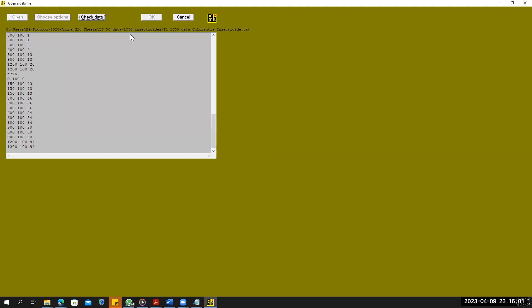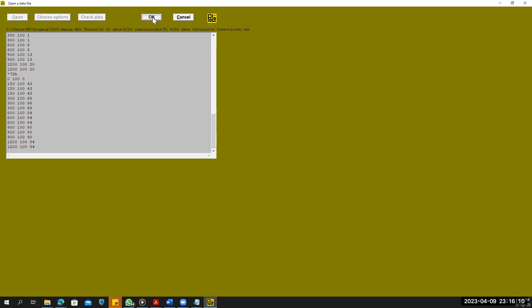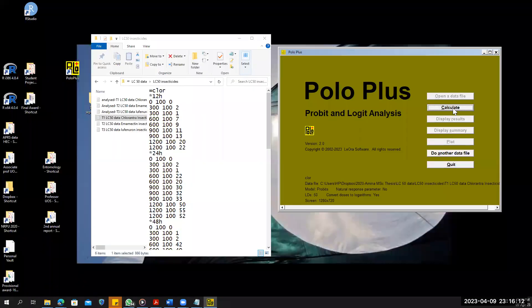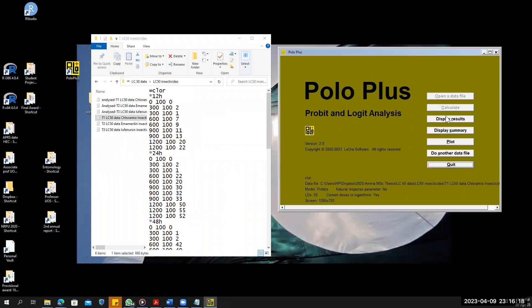Check the data — no errors. It means it can calculate the LD50. If we have errors, we have to remove all those errors. Click OK, and we will have this window. Click Calculate. Now it's calculating — and it has calculated.